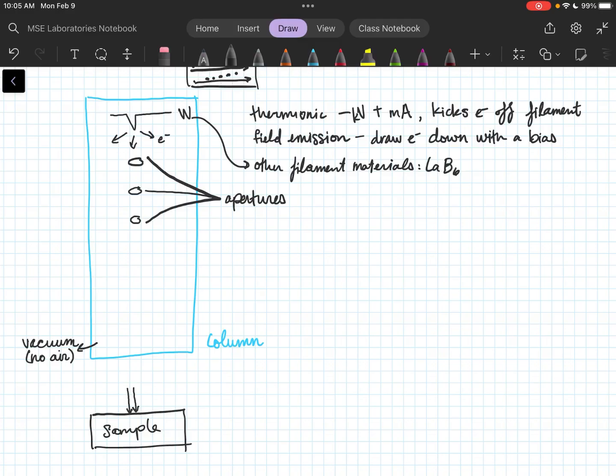So these apertures are sort of like tiny little donut-shaped discs. They are very thin and flat, so they're not rounded like a donut is, but they've got the circular shape, and then a tiny little hole in the middle. We can have lots of different types of apertures. We can have fixed, which would be like they just sit there. They don't move around. There aren't different sizes. They just are. We can have movable.